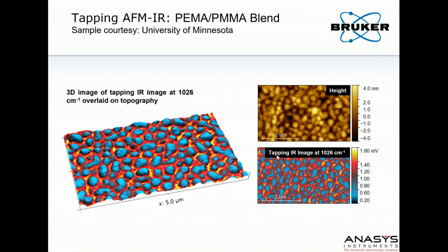We can also overlay this into a 3D image that overlays the height with the chemistry. So you can see the islands of PMMA in the sea of PEMA using the tapping AFM-IR. This sample came from the University of Minnesota.